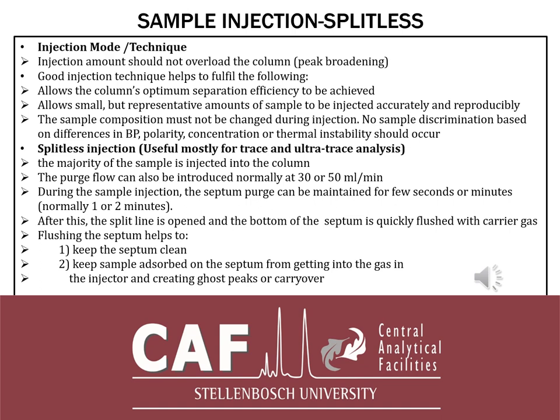Splitless injection, under the injection mode or injection technique. When one does the splitless injection, everything that you inject goes into the column, and then you get higher peaks, and it increases the sensitivity of your chromatography, and one uses SPME when you're working with trace and ultra trace. But anyway, a good injection helps to fulfill the following. It allows the column's optimum separation efficiency to be achieved. It allows small but representative amounts of sample to be injected accurately and reproducibly. The sample composition must not be changed during the injection.